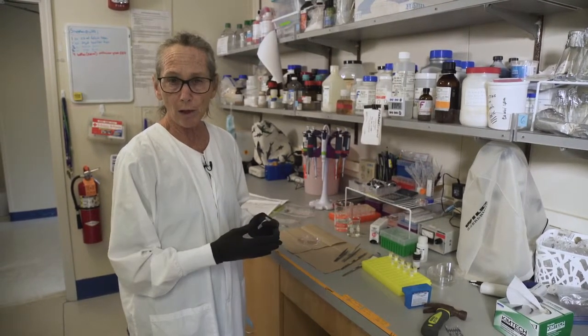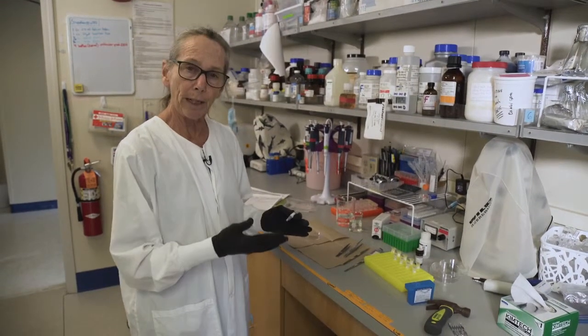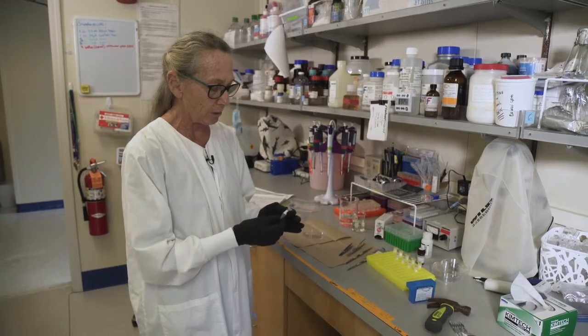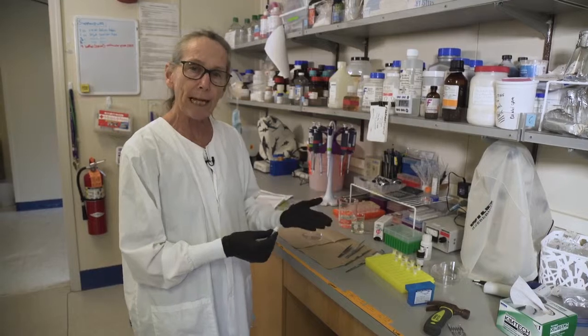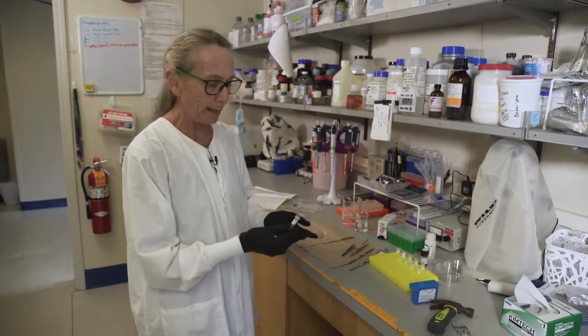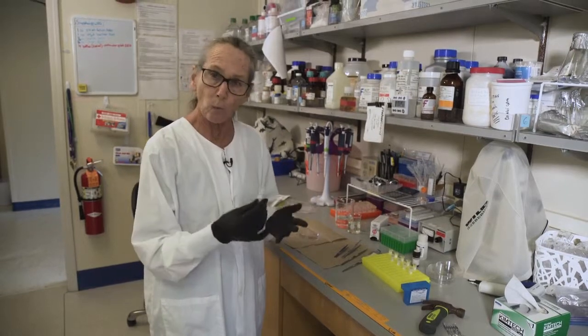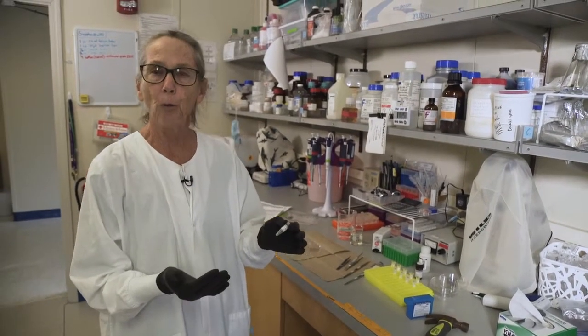If we run a quantitative PCR, or qPCR, we can approximate how many larvae there would be per milligram of tissue, so knowing the sample weight is very important. If we just want a yes or no answer, the sample weight is not that critical. The first thing we'll do is weigh the empty tube.